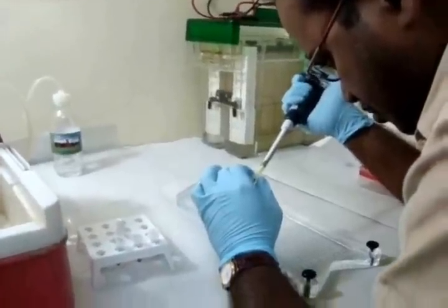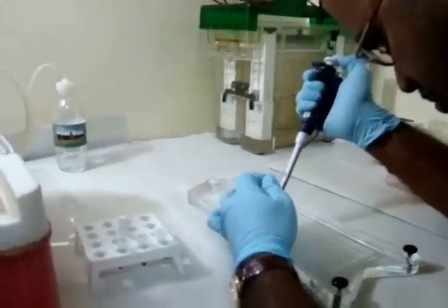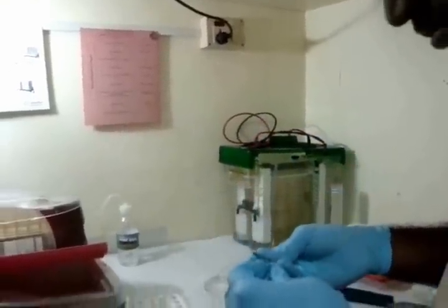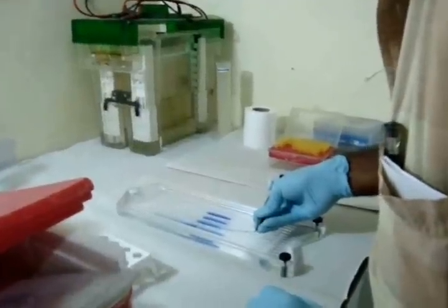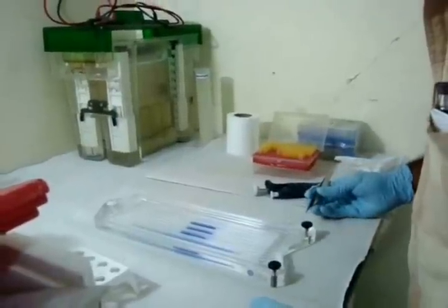The first step is IPG strip rehydration. The rehydration stock solution is prepared and the IPG buffer is added to it. The protective cover is removed from the 18 cm IPG strip, and the IPG strip is positioned with the gel side down. The lid is slid onto the reswelling tray.